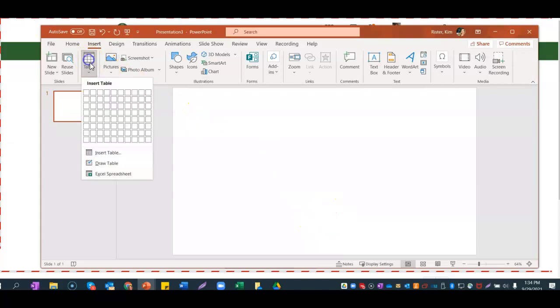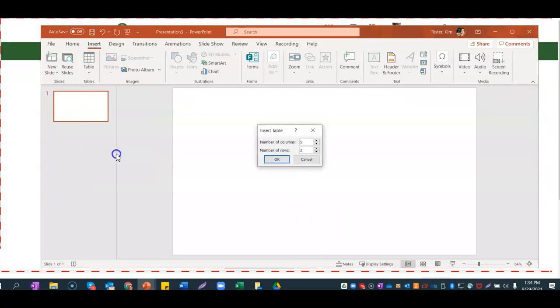So if you create a table, okay, you would insert a table. You could do it on a spreadsheet too if you wanted, but this is the harder part for students sometimes. So the columns we know go up and down, right? And we're going to have our substance, the mass, the length, the width, the height. So basically the volume, that's another one, and then the density.